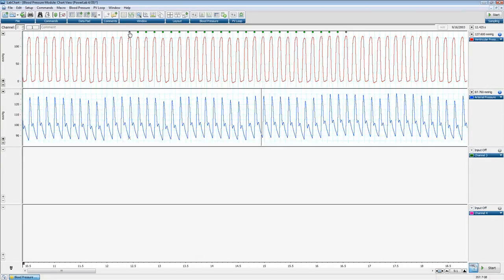Those are not being included in your actual analysis, and basically the reason for that is the module needs at least 2 beats to start performing the analysis, and that's exactly why here. So those will not be included. If you want to include those, you might want to make the selection a little bit bigger.